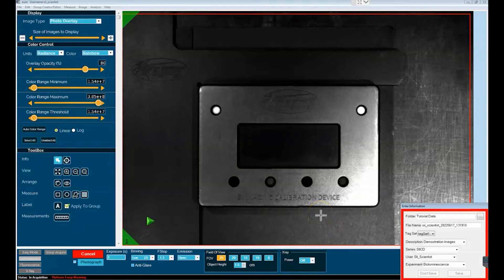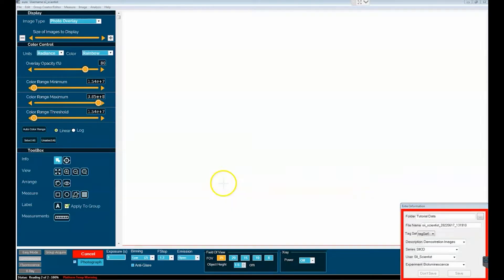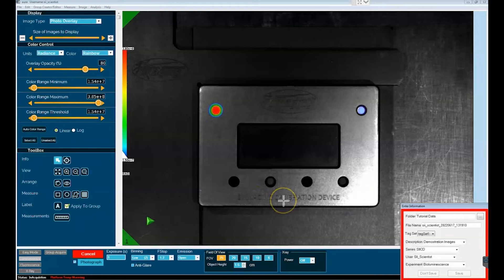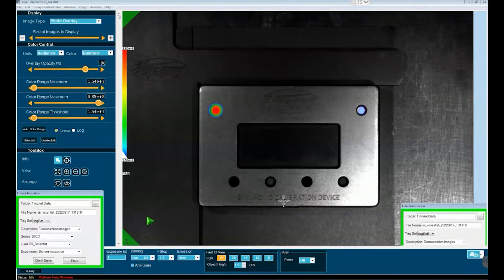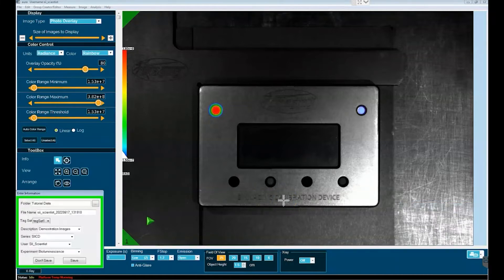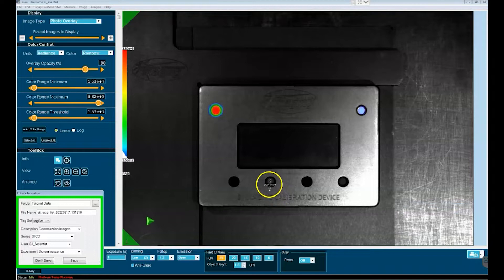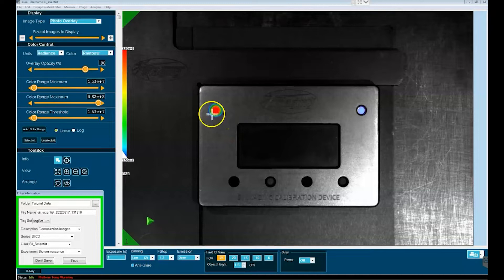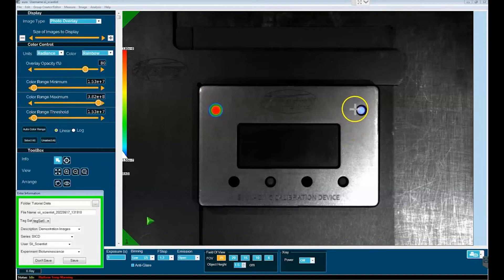The first part of the image presented is a white light photograph, and what you can see here is our calibration device. Now what has been added on top of the white light image is the luminescent data from the calibration device, and what we can see is that we have two different signals - one here off to the left and another off to the right.